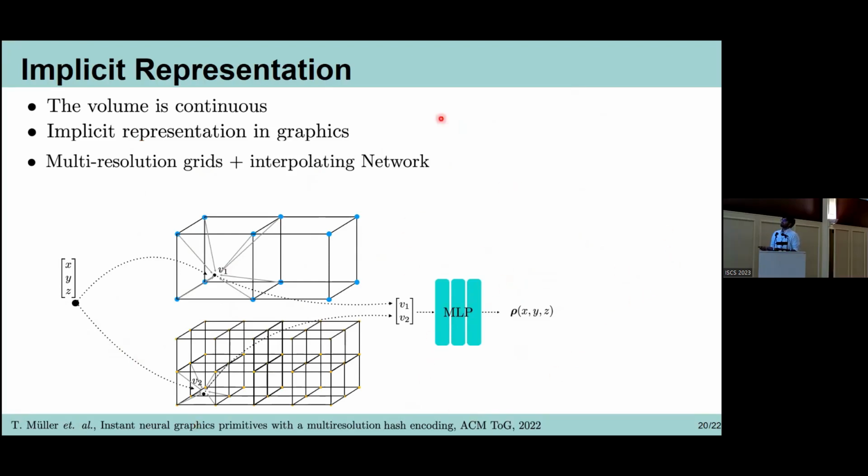So we use this model for our representation of the volume. Now, to parameterize the deformations, the trainable parameters are the MLP and the feature grid vectors. To model deformations, we have 3 of them. First is the shift, and the trainable parameter is tau m, which is just a 2D vector.